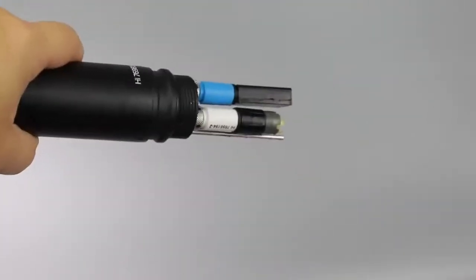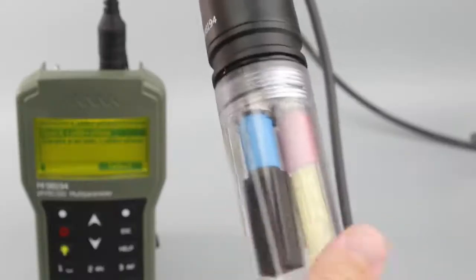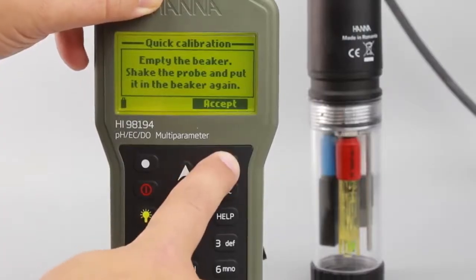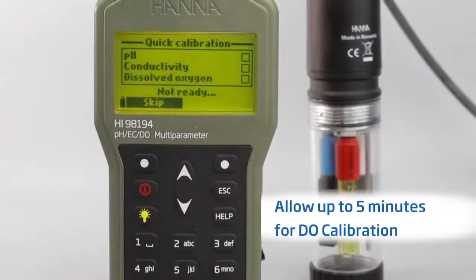Then, shake any remaining liquid off the probe. No droplets should remain on the DO sensor tip. Screw the empty calibration beaker back onto the probe body. Press accept and then press confirm to finish calibration.